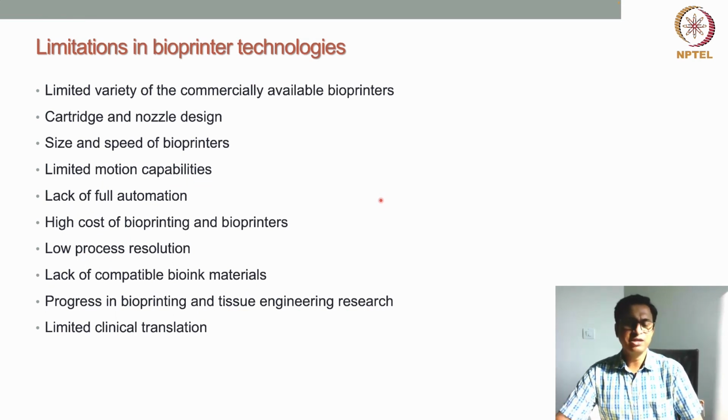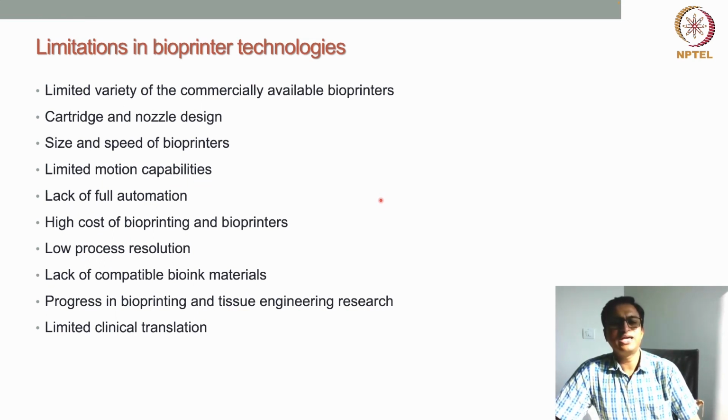So all these are limitations of the current bioprinting technology, and there is a huge scope for development and improvement of all these parameters, so that this bioprinting technology can be widely used for different tissue engineering and regenerative medicine research.